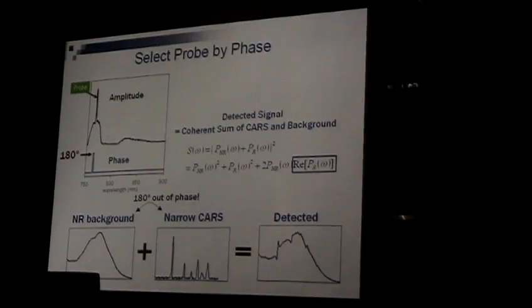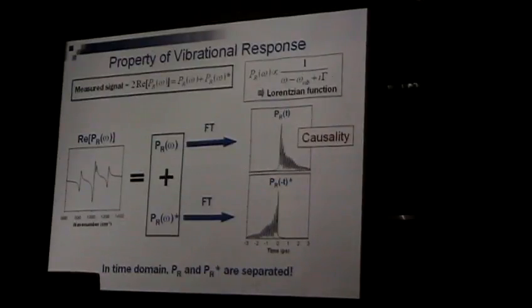And by the way, the sample here is just totally on the microscope. This is like our test bed because it's so strong. So you have this kind of knots, and if you look at the formula, you realize what you get is the real part of the vibrational spectrum, and what the Raman spectrum looks like is the imaginary part. So in one sense, what you have to do is find some numerical process that converts the real part to the imaginary part. And if you study some optical spectroscopy, this is actually well known, almost 100 years ago.